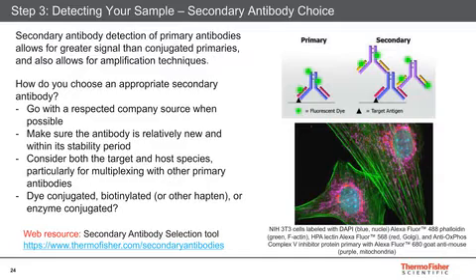And then, do you want it to be dye conjugated or biotinylated or enzyme conjugated? We'll talk about amplification techniques in a moment. Realize that we have a web resource, too, that you can select an antibody at this URL.